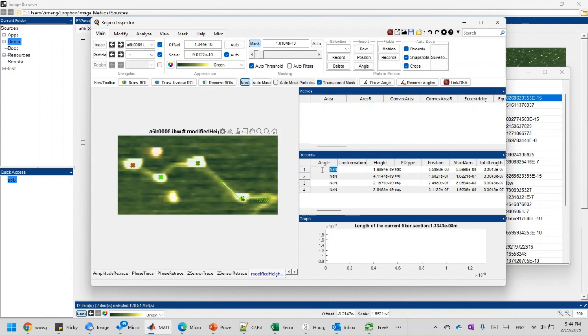I select the first row by clicking one of the cells and right click the angle and say add to angle 1. So the number is put there, and do the same thing for the remaining angles. Let me just finish drawing this first. And notice that the last protein has no angle because it's the end protein, so we're not going to measure angle for that one.